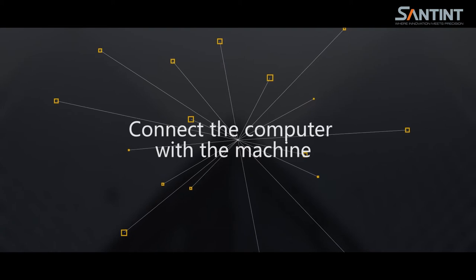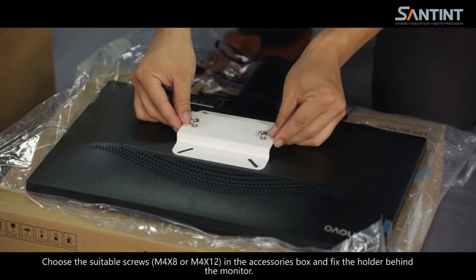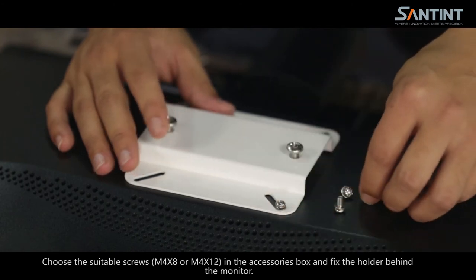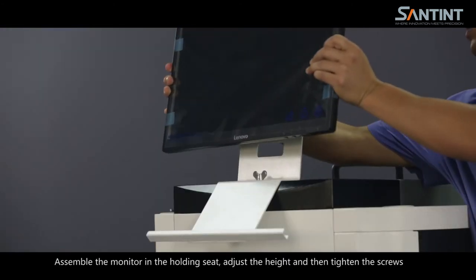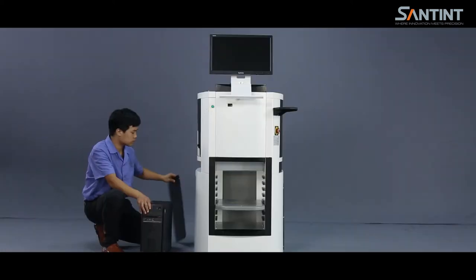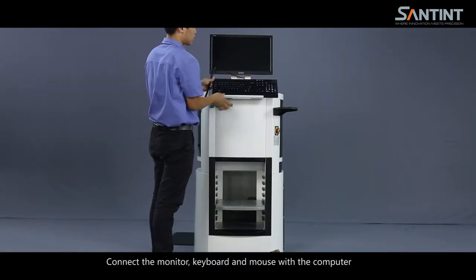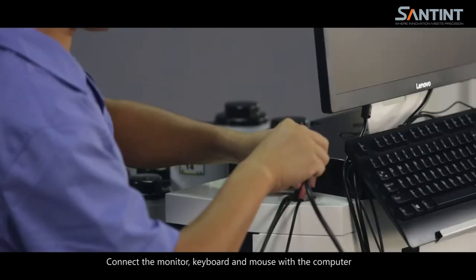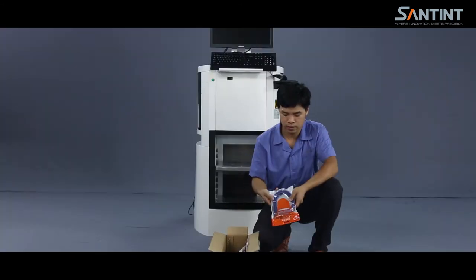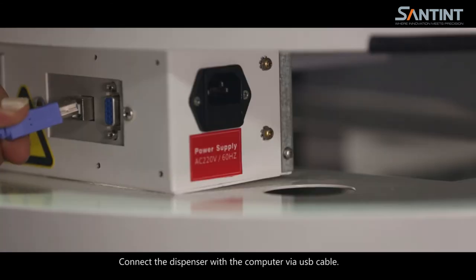Connect the computer with the machine. Remove the current base of the monitor. Choose the suitable screws M4 x 8 or M4 x 12 from the accessories box and fix the holder behind the monitor. Assemble the monitor in the holding seat, adjust the height, and then tighten the screws. Connect the monitor, keyboard, and mouse with the computer. Connect the dispenser with the computer via USB cable.